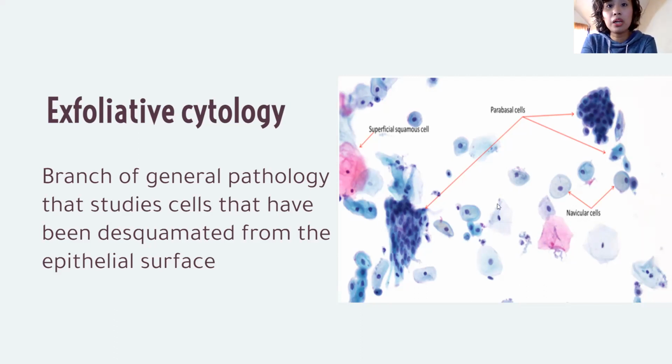So guys, this is an example of pap staining from your cervico-vaginal smear. So, ito makikita niyo yung different types of cells. And so far guys, lahat ng cells dito normal ha. So, we have superficial squamous cells. Isn't it that class ang vagina has stratified squamous cells? Ibig sabihin, magkakapatong na squamous cells. Aside from that, we have parabasal cells and navicular cells.